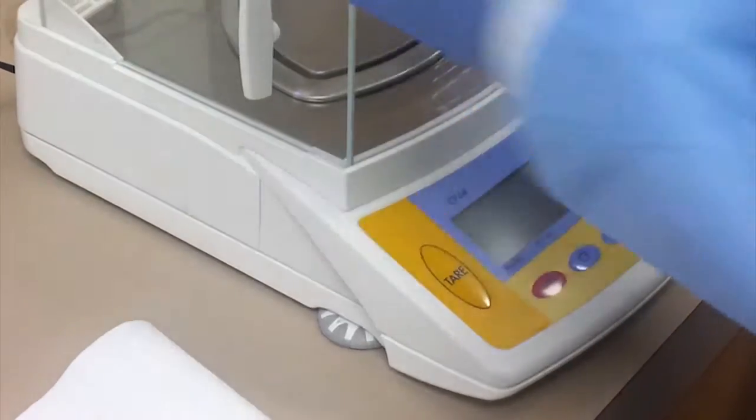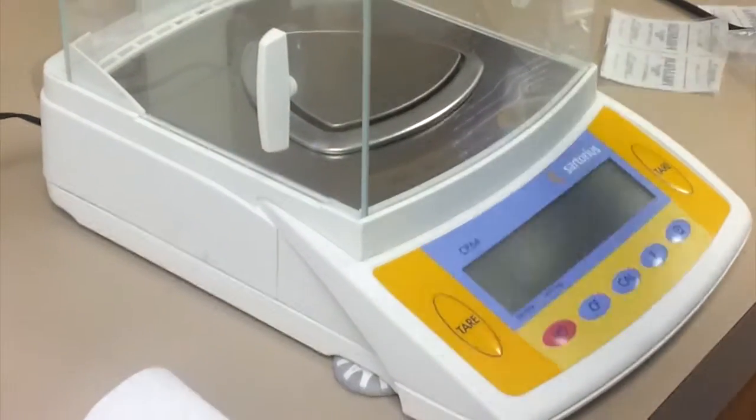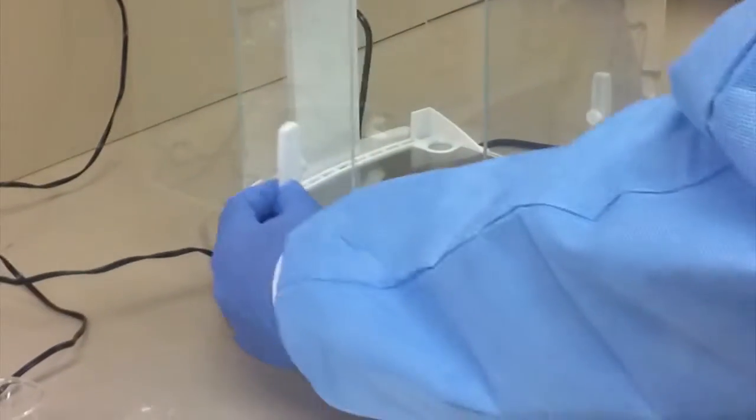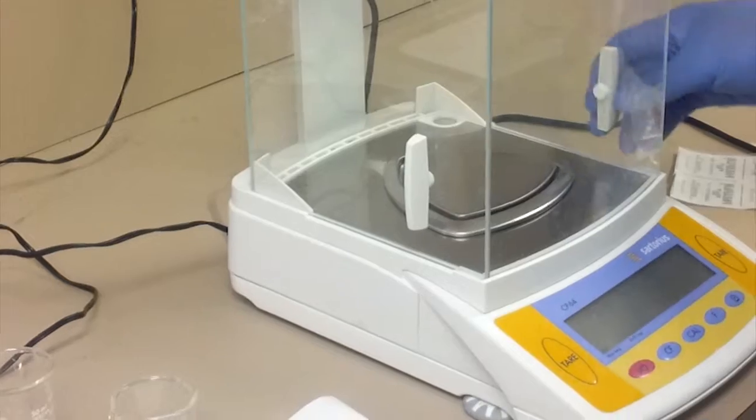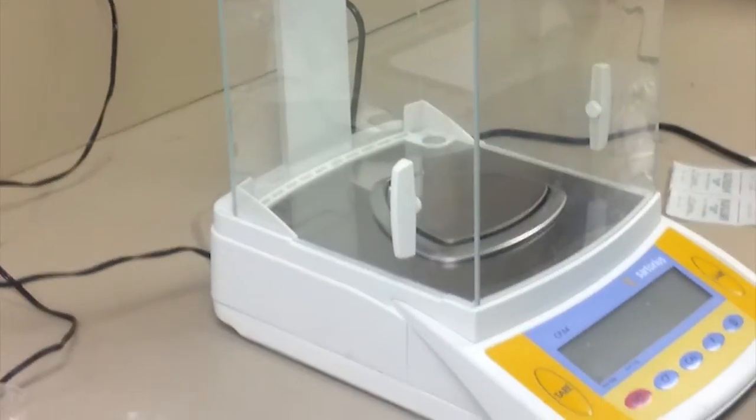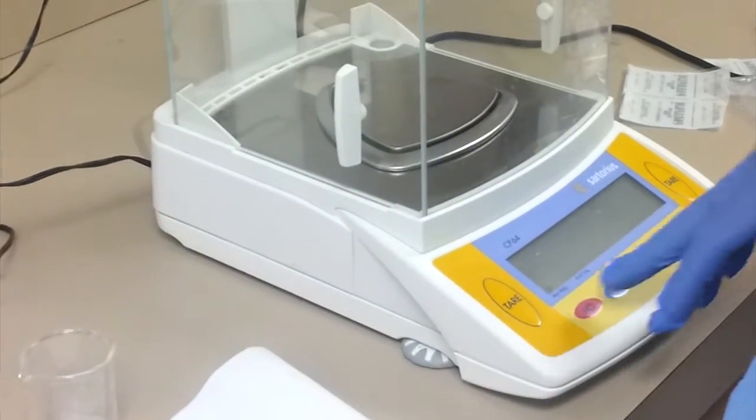As you can see, there's a cage up front, and it is utilized to block any interferences like wind or other vibrations. You can open it from either side or even from the top, and this allows you to hold your substance that you're weighing safely.